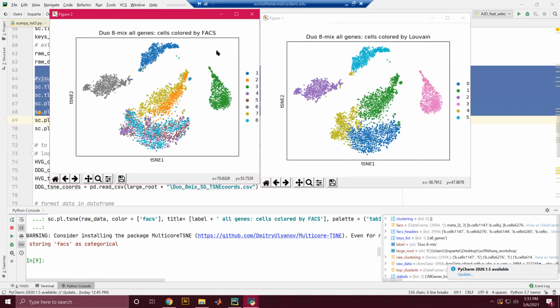And these are the real ground truth labels. So there are distinct antibodies that correspond to B cells, monocytes and natural killer cells. And then there's this T cell cluster. There are regulatory T cells and helper T cells and cytotoxic T cells and progenitors of each of those.